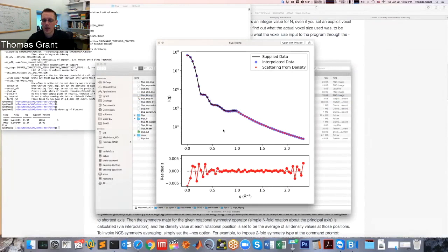And so one thing is that when you have a box that has a voxel size, in the case of lysozyme, I think in this particular case, the voxel size was like 2.4 angstroms or something like that. But our data doesn't go out to 2.4 angstrom resolution. And so it has to put something there. And if you let it just go randomly and just do what it wants, it'll oftentimes give you some artifacts that are not realistic. And so we just use Porod's law to extrapolate it in not a particularly realistic way, but these are all really high resolution terms that don't have a huge impact. But if you don't restrain them, it can do some funny things. So that's all that is.